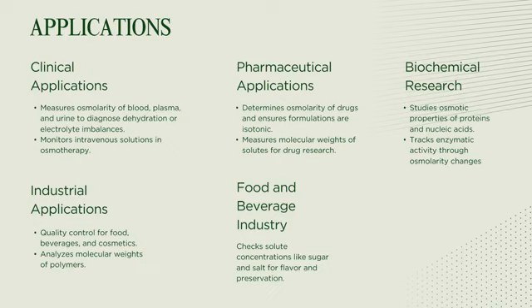It also ensures the consistency and quality of solutions used in food and beverage production, cosmetics, and industrial formulations. It is also used to measure the concentration of sugar, salt, or other solutes in food and beverages. It ensures the correct balance of osmolarity for taste, preservation, and safety.